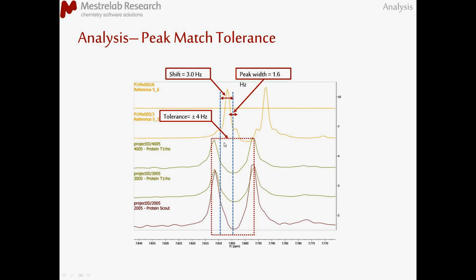So it's always worth spending some time initially with your data and setting up the tolerances. We will see this later in the practical session. The tolerances are how much we are going to allow the software to go either one way or the other looking for peaks. Obviously, this has two sides.